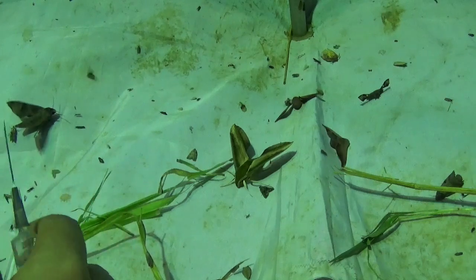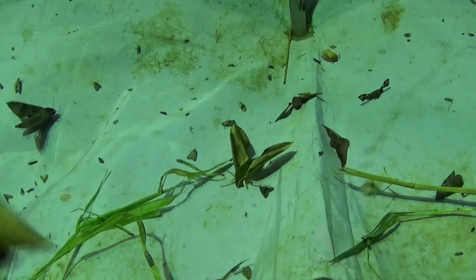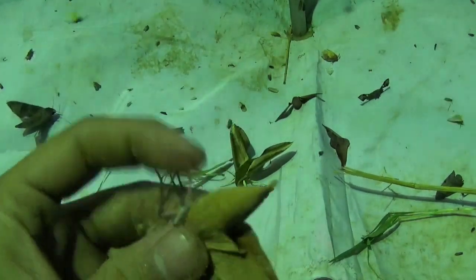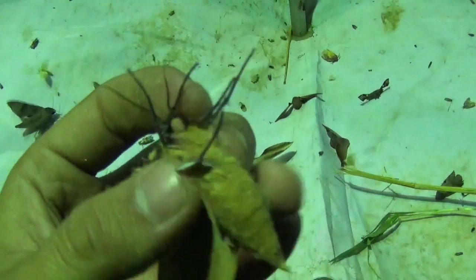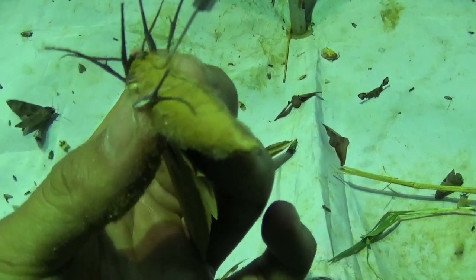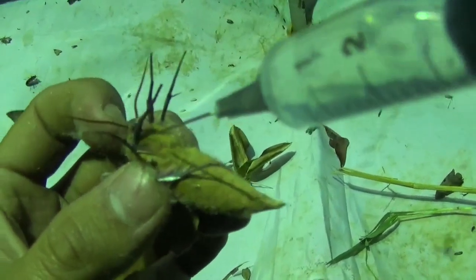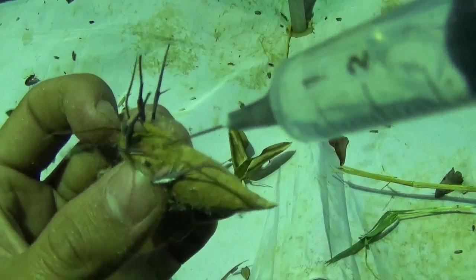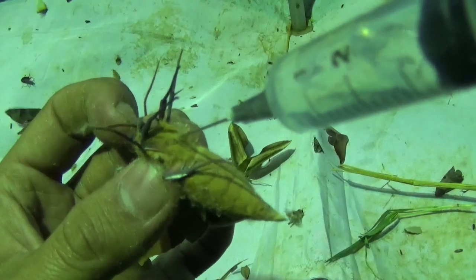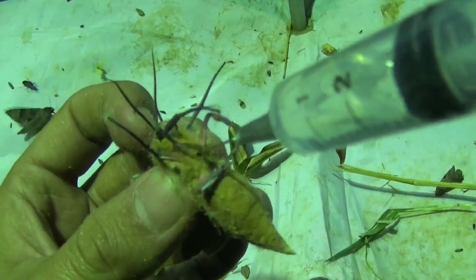The proper way to finish it off: take the insect firmly with two hands, with the thorax pointed above. Then we can inject the insect here in its thorax with a brief shot of ethyl acetate. I am going to do it in 3, 2, 1. And it is dead.